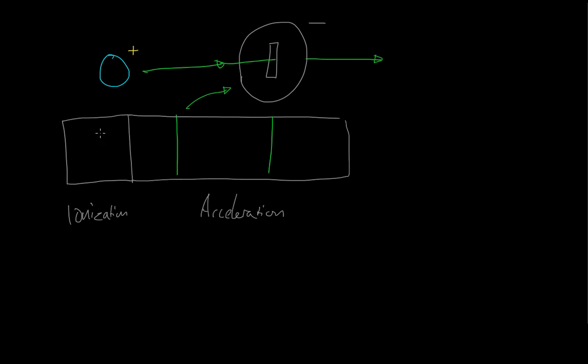So when we first accelerate it, we're going to have a bunch of particles here that all move. Let me use a different color for this, make it a bit clearer. That all move the same direction towards these negatively charged plates here. But seeing as there is only a slit here, only the ones travelling directly here get through.